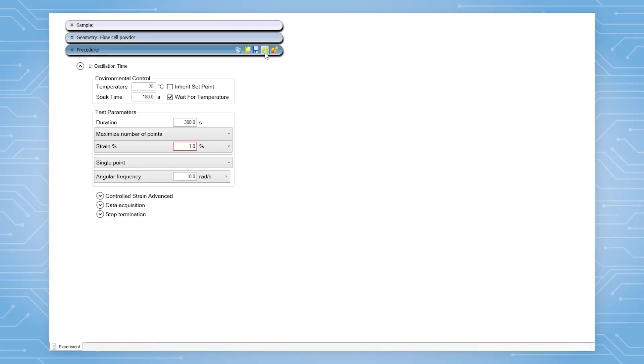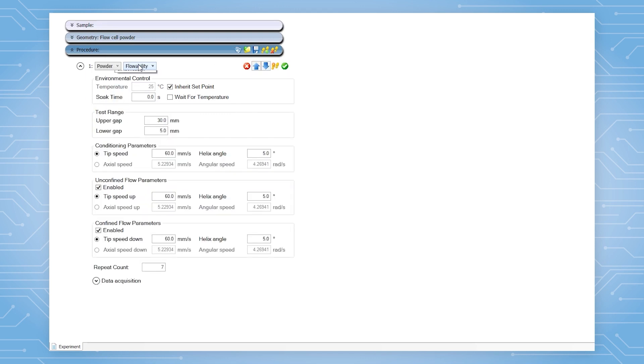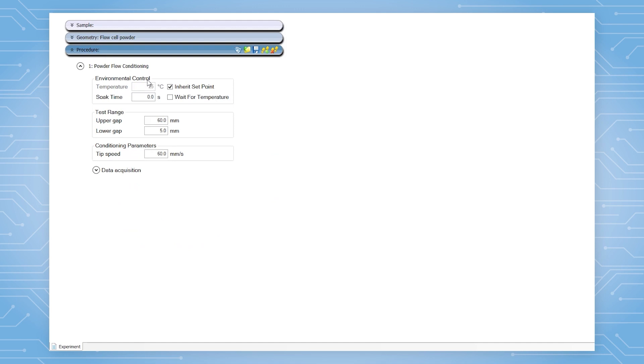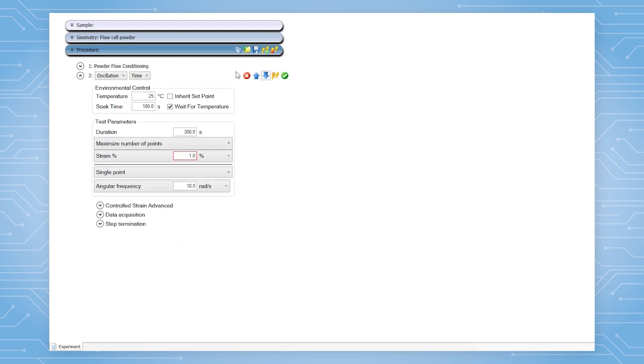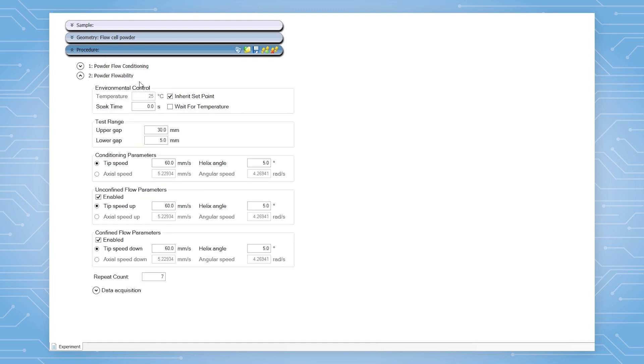To set up a powder flow test, navigate to the experiment tab in TRIOS. Select powder in the test type drop down menu. This type of test will only be displayed if a powder geometry is installed. The first step is powder flow conditioning and the second step is powder flow ability.